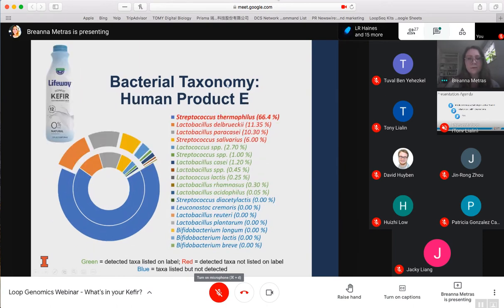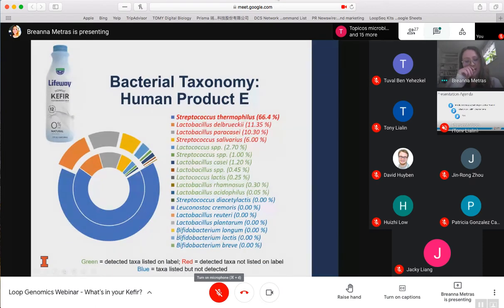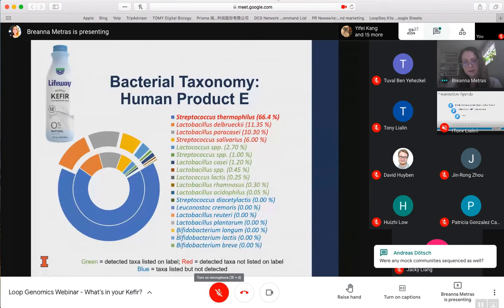And then the last human product, we have Lifeway Kefir. This one is definitely the most well-known brand for selling kefir products, yet the top 4 most predominant species in their product were not listed on their label, which I thought was very surprising. And so you can see Streptococcus thermophilus, Lactobacillus delbrueckii, Lactobacillus paracasei, and Streptococcus salivarius, all of which are in pretty large abundance in this product, and none of those are listed. And I would also just like to draw attention to the end again, saying that a lot of the blue that were listed on their label was not found in the product at all. So that should be interesting.